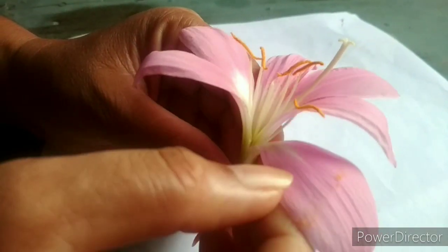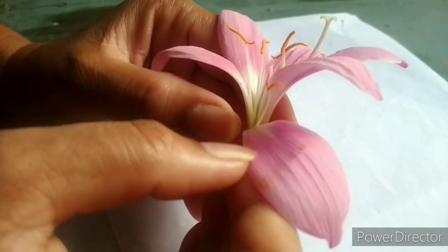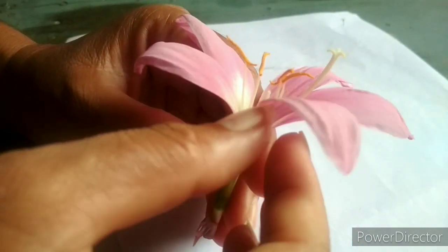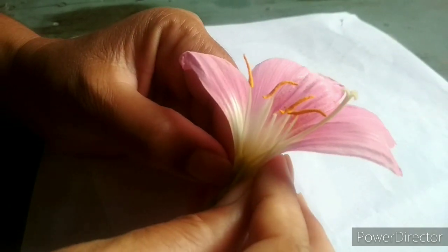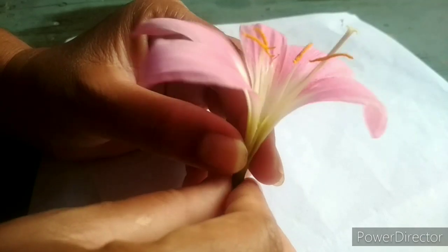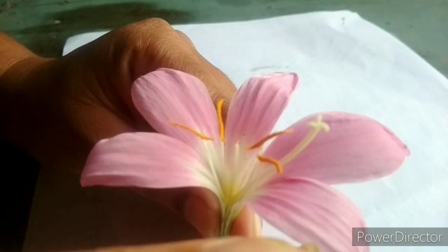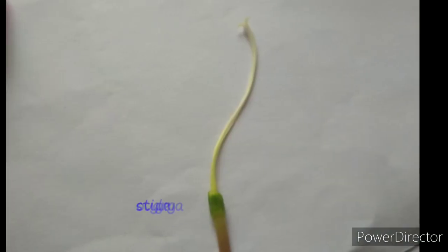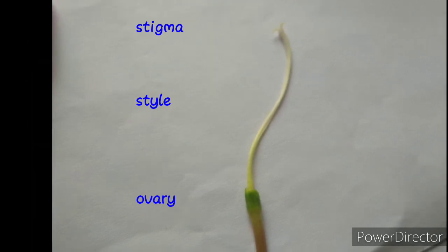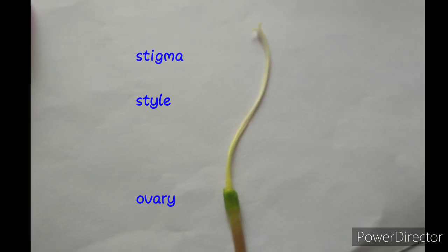To see the inner parts of the flower, I carefully remove the petals. After removing the petals, we can see the inner parts clearly. In the pistil, the stigma of the flower is usually sticky, because the pollen grains stick onto the stigma. So these are the inner parts of the pistil: stigma, style, and ovary.